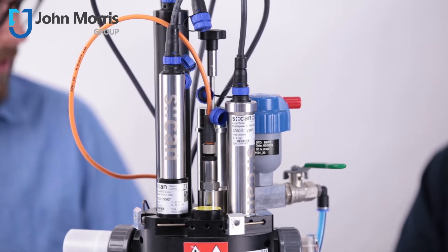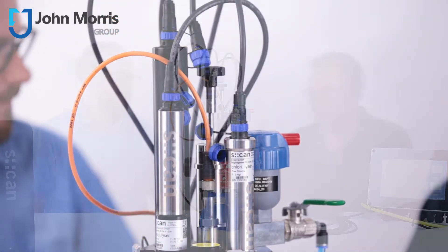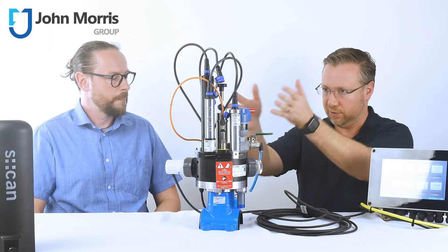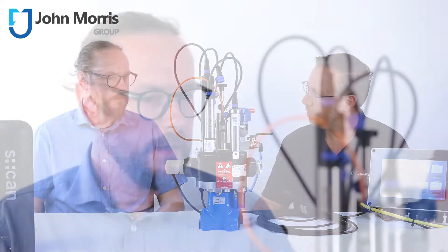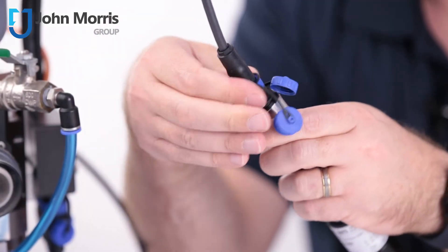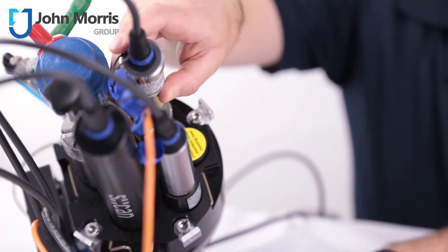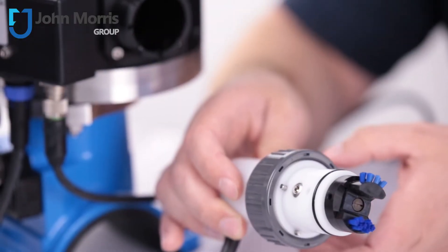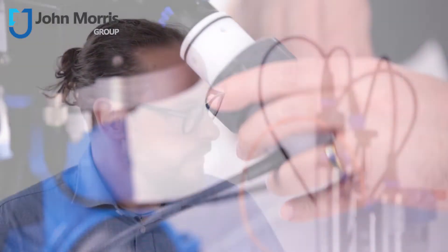How much maintenance does a system like this require? I mean it's got a lot of things happening here. Yeah, so actually the maintenance is very low, depending on the probe you choose. If you have an ion selective probe, you have to replace it after six months, so it's consumable. And the other probes, for example the optical probes, only need some cleaning. In this case we have a brush here, so mechanical cleaning. Maintenance is very low actually.